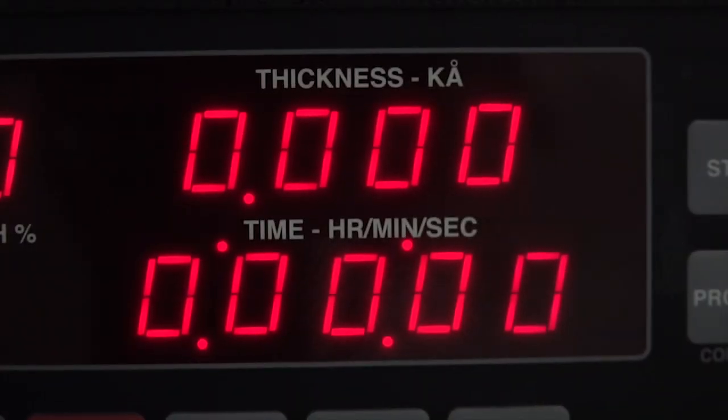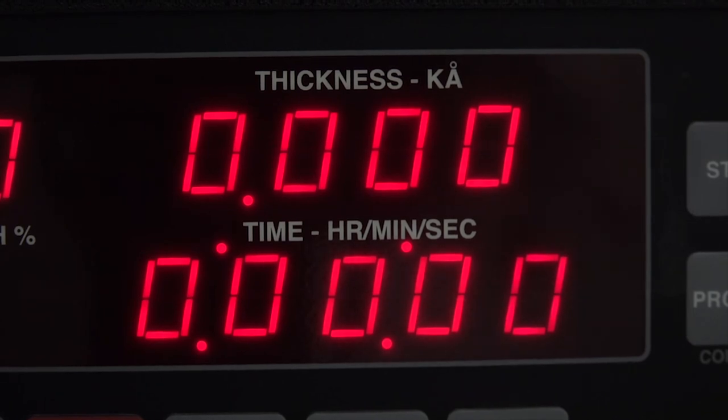The thickness monitor will tell the computer when we've reached our desired thickness, and the process will halt. We can see the thickness monitor indicating the thickness in real-time. Okay, we've reached our desired thickness, and the process has automatically stopped.